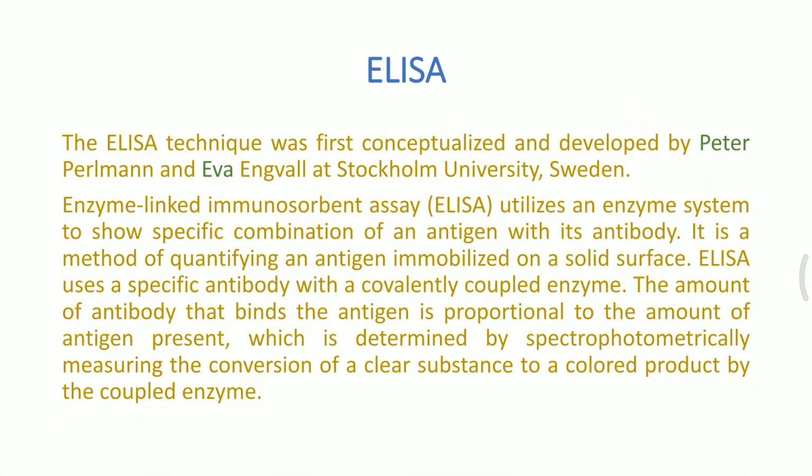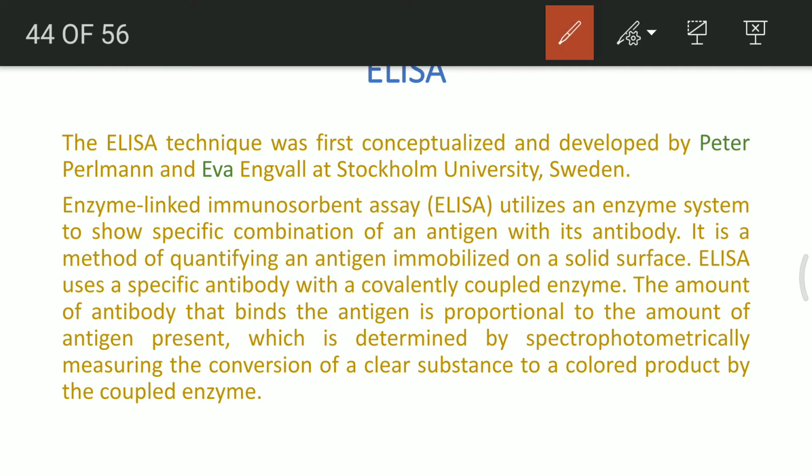ELISA was a technique which was conceptualized and developed by Peter Perlman and Eva Engvall at Stockholm University in Sweden. Enzyme-linked immunosorbent assay utilizes an enzyme system to show specific combination of an antigen with an antibody.